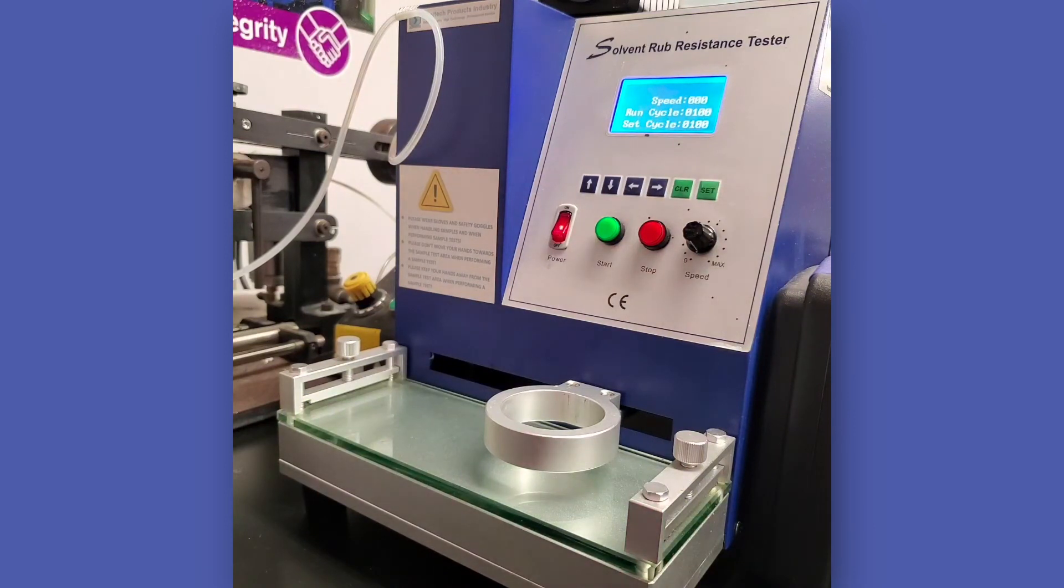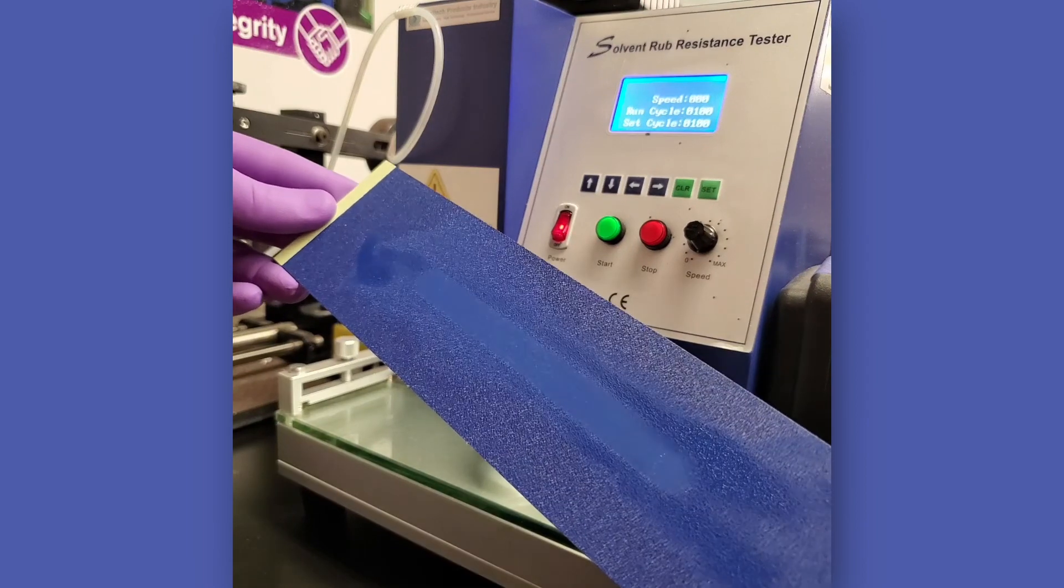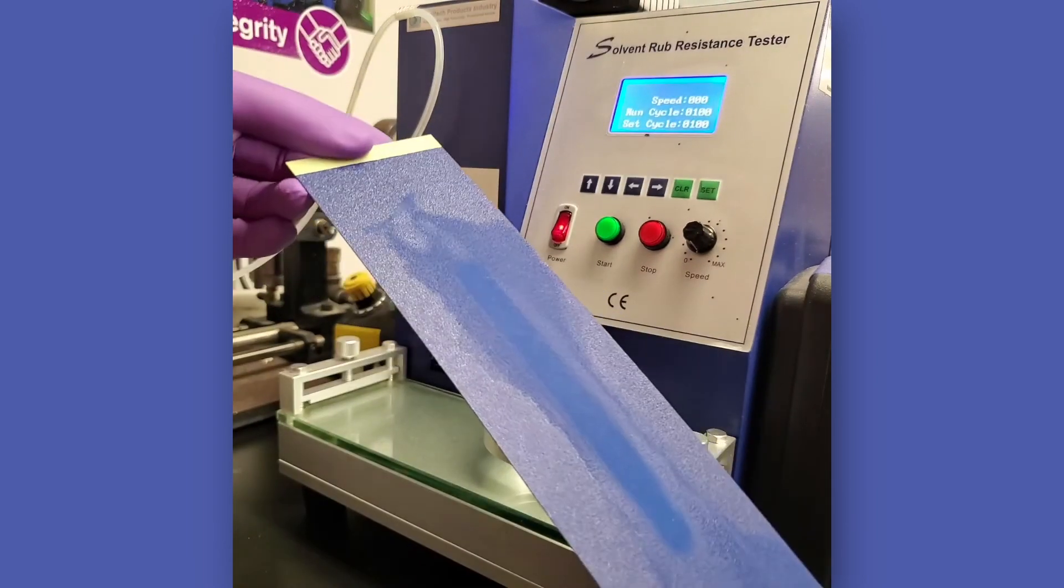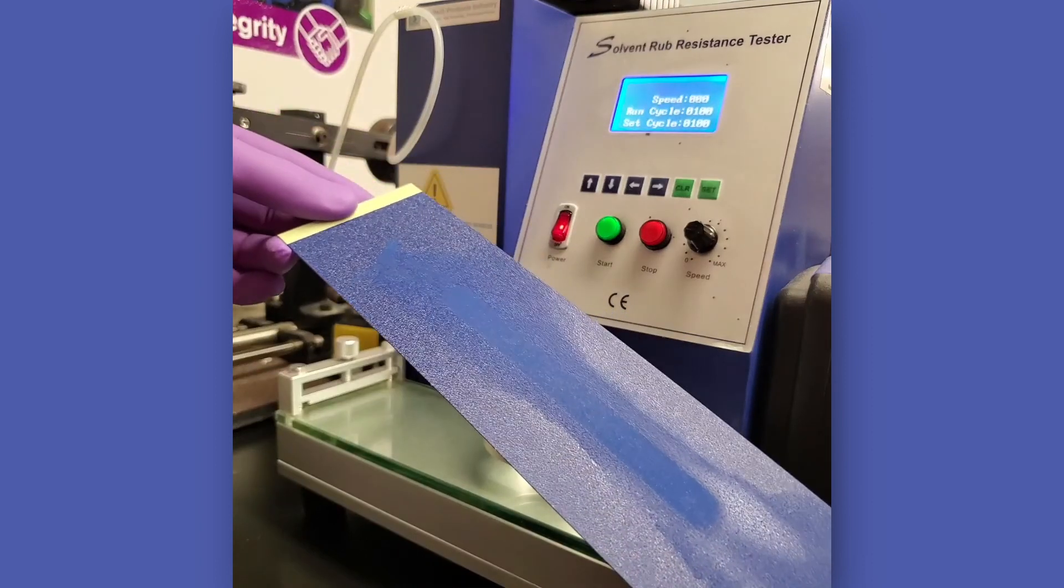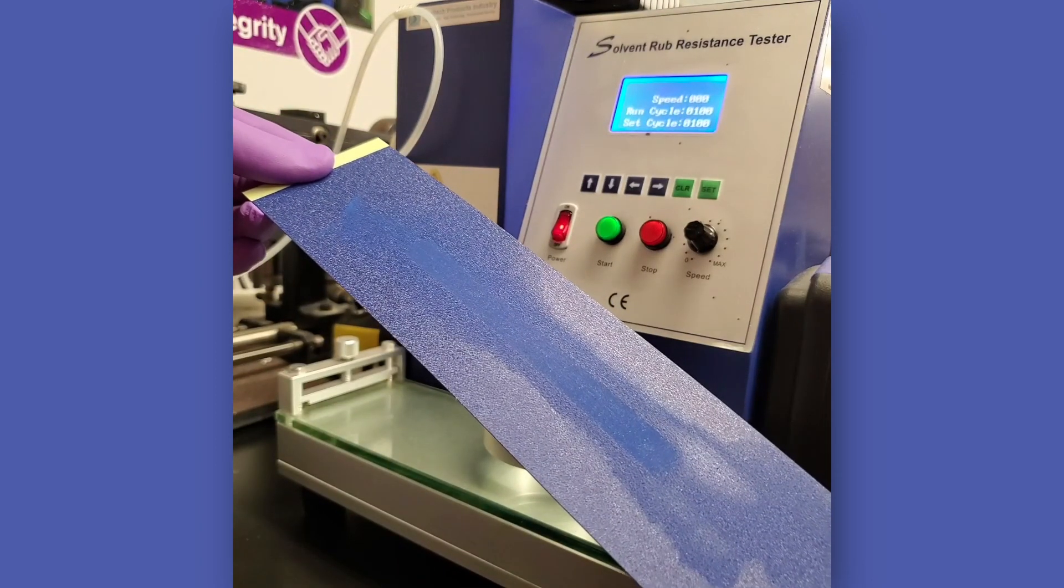In the second method, the machine is also allowed to run until the operator observes the appearance of the substrate or coating breakthrough. The number of double rubs on the machine counter is recorded. The second method may be more useful for research or cases where comparison of continuous data is desired.